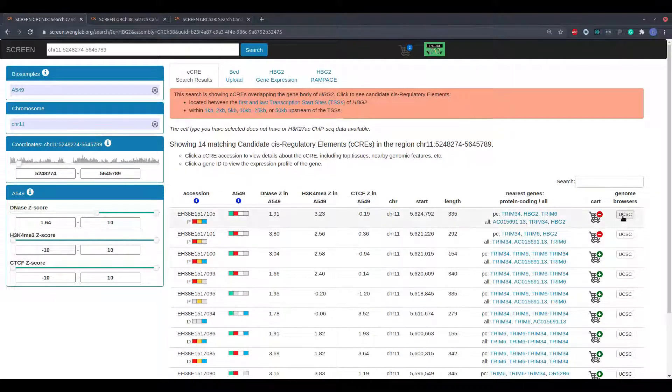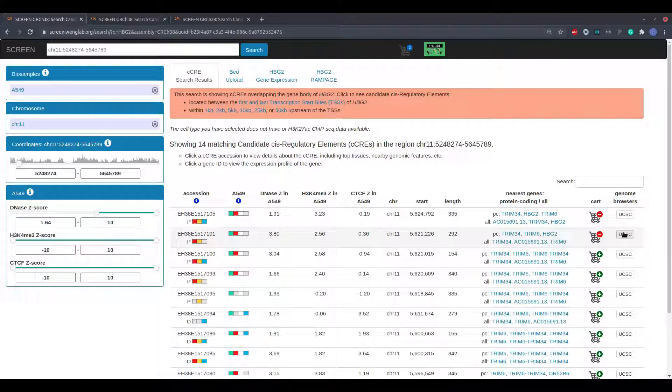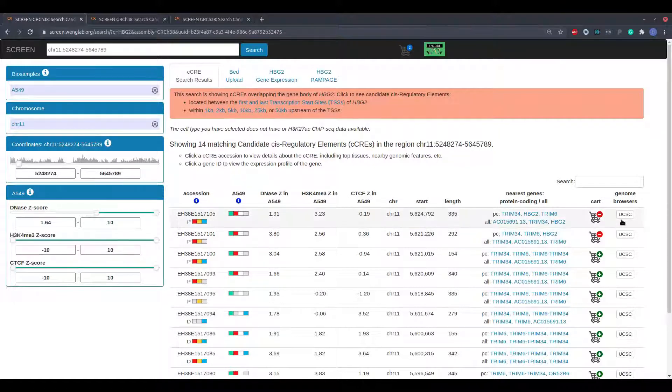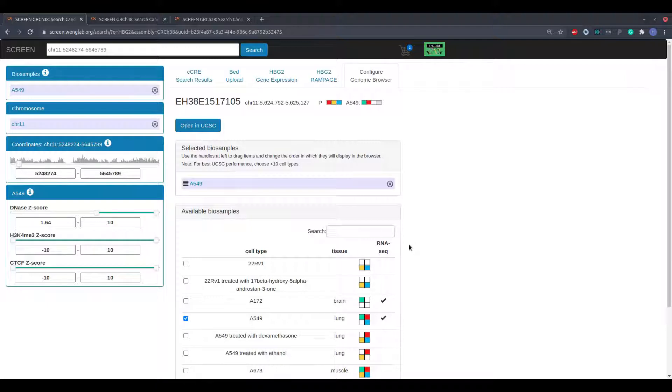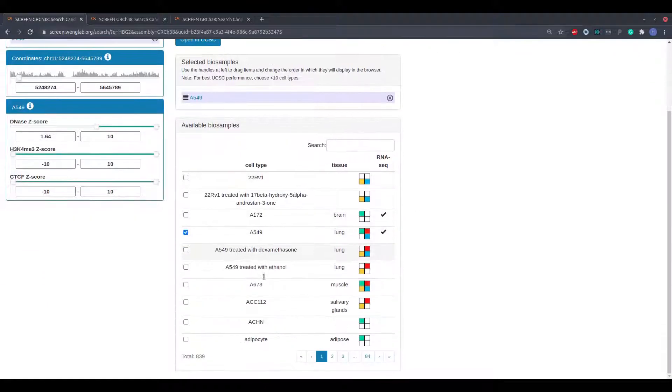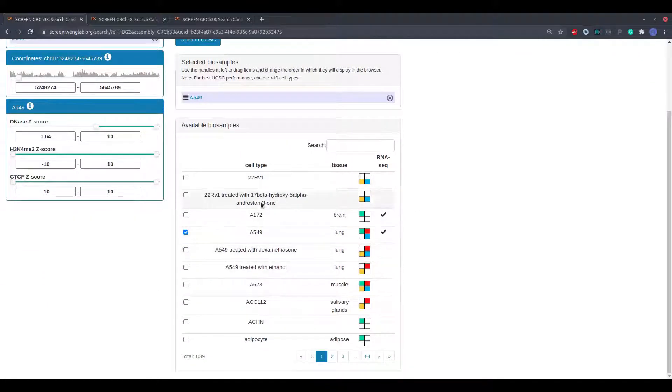The final column provides a link for visualizing the candidate regulatory element in the UCSC genome browser. Clicking the UCSC button brings up the Configure Genome Browser view, which allows the user to select data from cell types of interest to visualize in the browser.